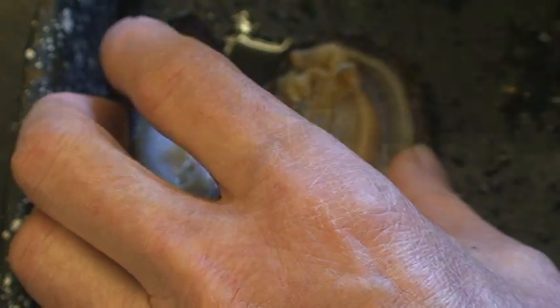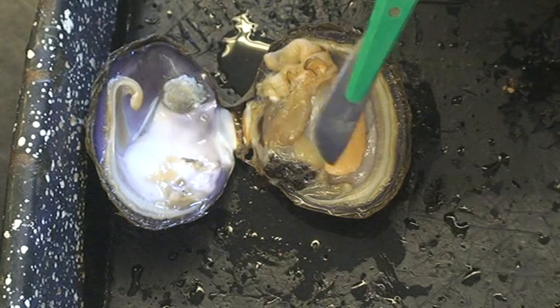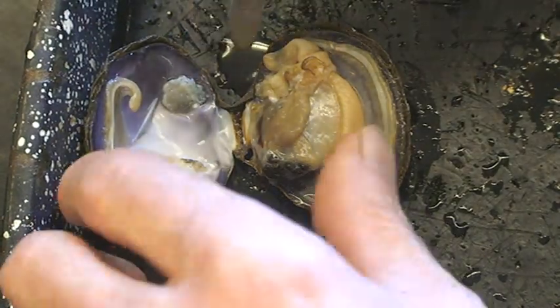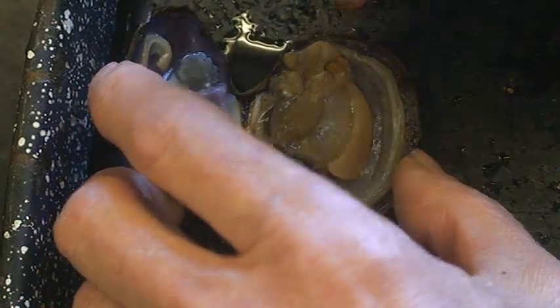This is posterior and this is anterior. Anterior is the side where the umbo is. The head is here, so this is the left valve and the right valve. If you open up a clam inside, there are some major organs that you see right away.